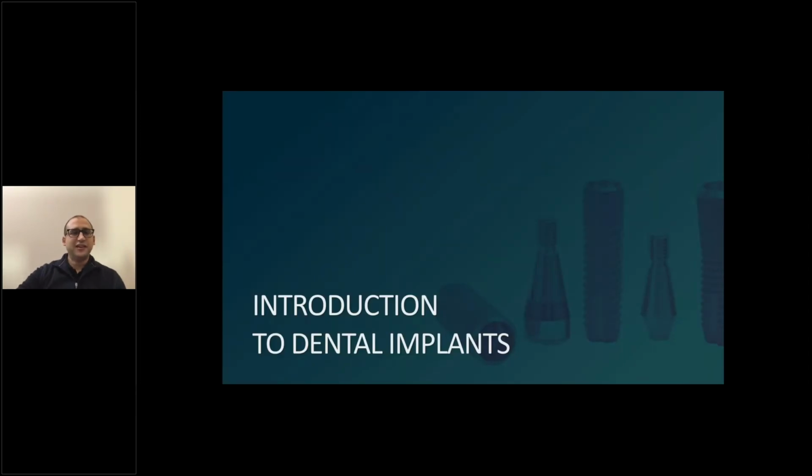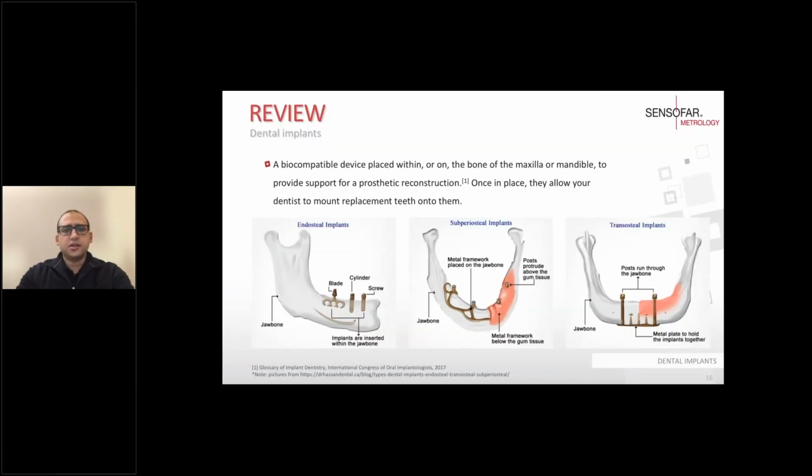All right, well, thanks for hanging in there in allowing me to explain the technology. And now in the next slides, we'll talk a little bit about our solutions for dental implants. So just a quick overview. Many of you I know are already experts in this, but there are 3 typical types of implants.